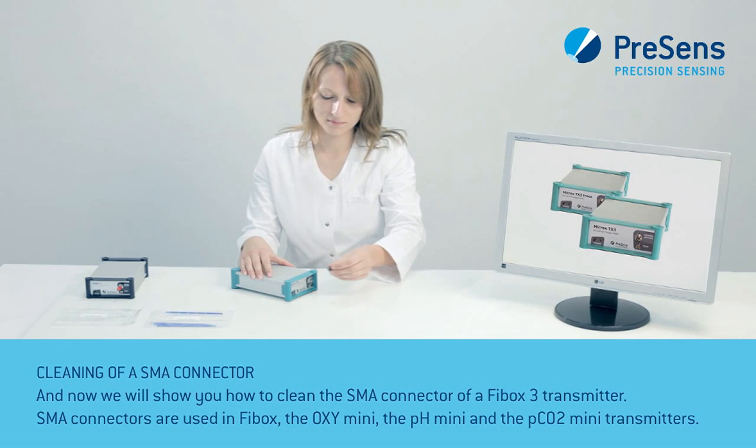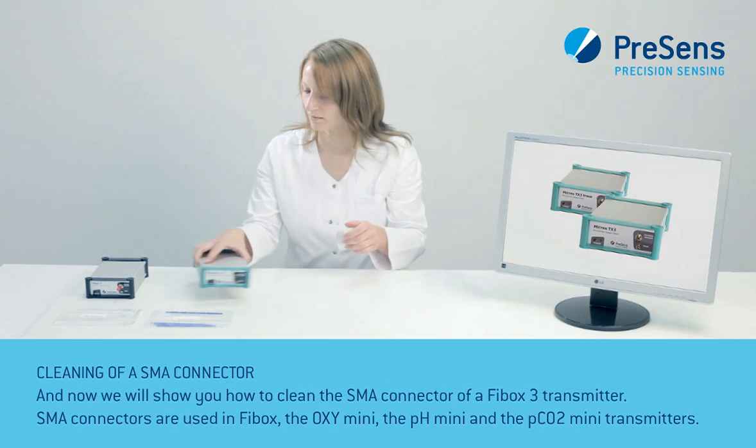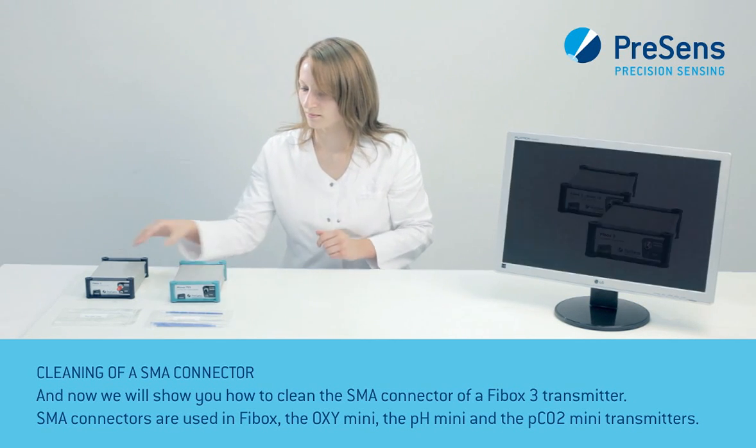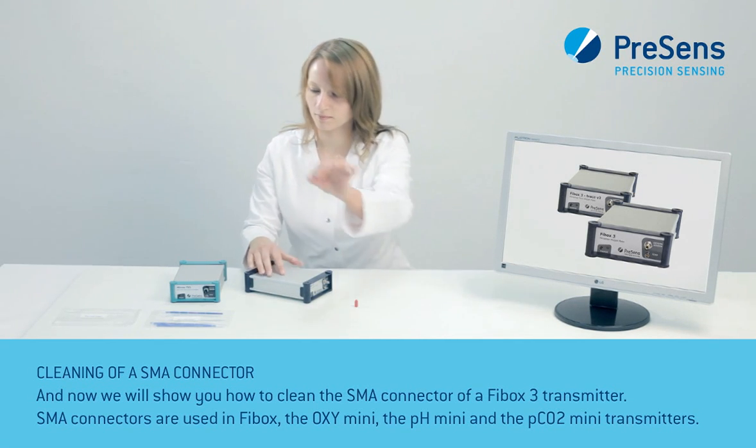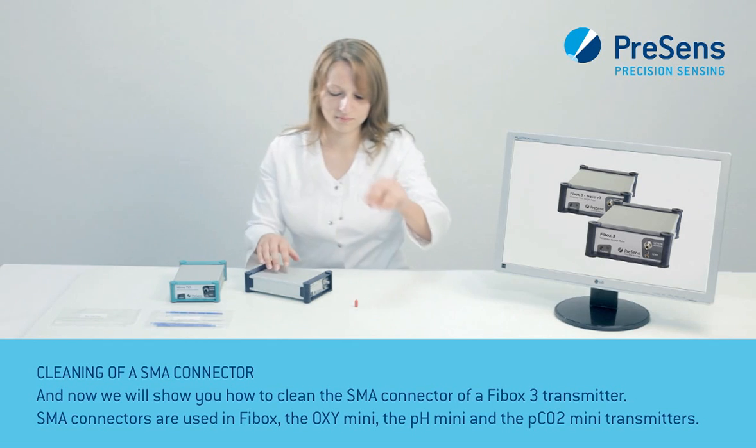And now we will show you how to clean the SMA connector of a FiBox 3 transmitter. SMA connectors are used in FiBox, the Oxymini, the PHmini, and the PCO2mini transmitters.